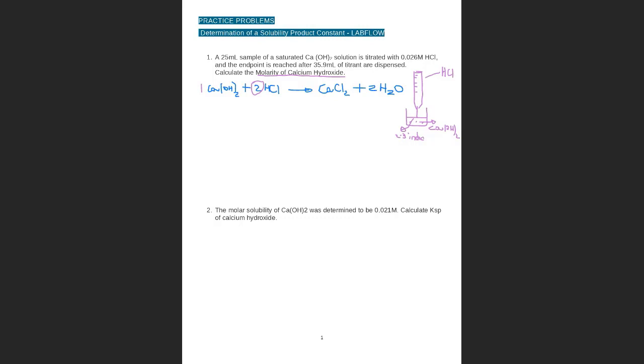Why do you want to titrate until the end point? Because the hydrochloric acid, that is our titrant, we know the molarity and we know the volume, because I will add, and then record. At the moment it changes the color, I will record the volume.